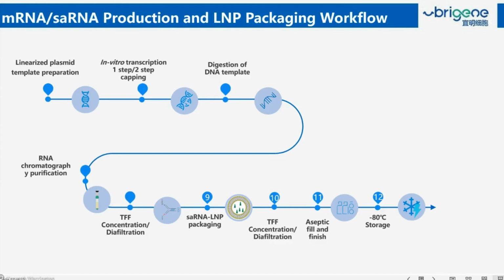These SA or mRNAs and the LNPs also have a straightforward, single-step purification where we can also fill and store.